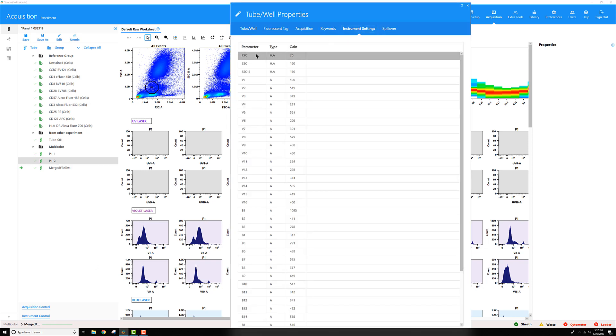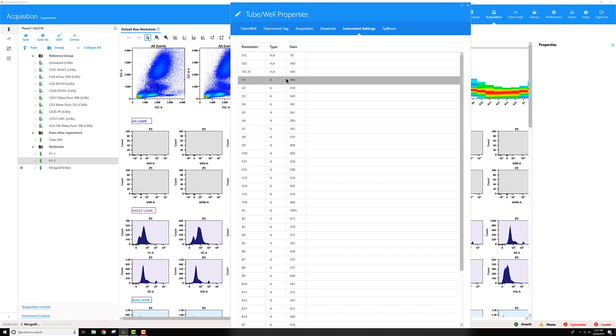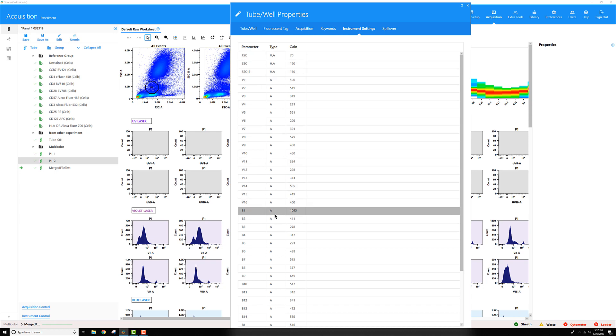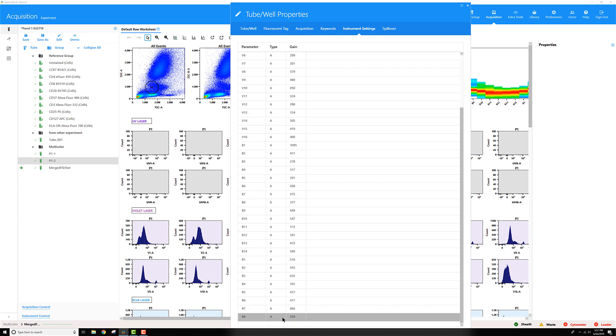I can see in this file that I've got forward scatter, side scatter, side scatter blue, all the violet area channels, blue area channels, and red area channels.